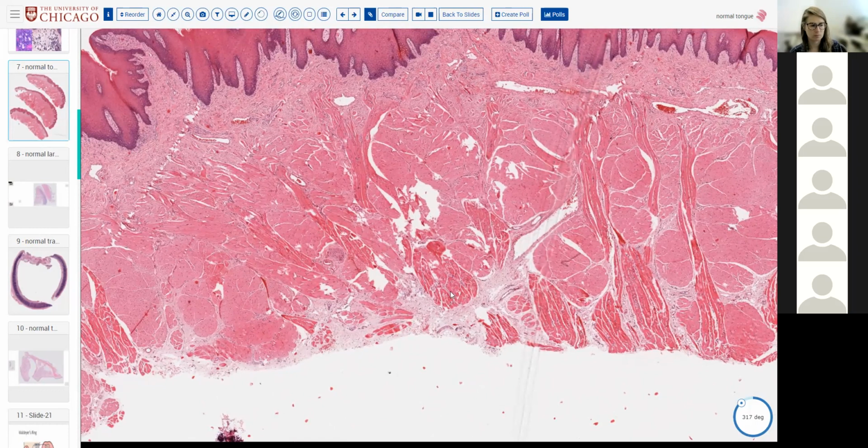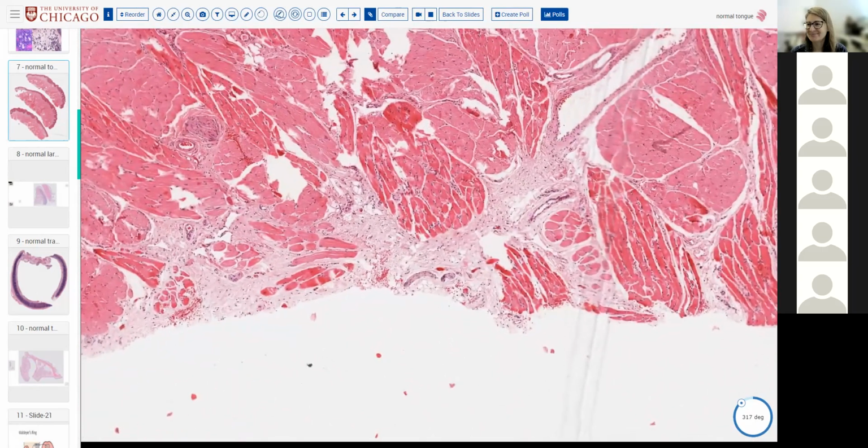They might have keratinization or... Yeah, the tongue muscles, not the... okay, yeah. Sorry. The direction of the fibers. Okay, so what's the direction of the fibers in the extrinsic? I'm sort of spitballing here, but I'm guessing these are the ones that are running from superficial to deep.